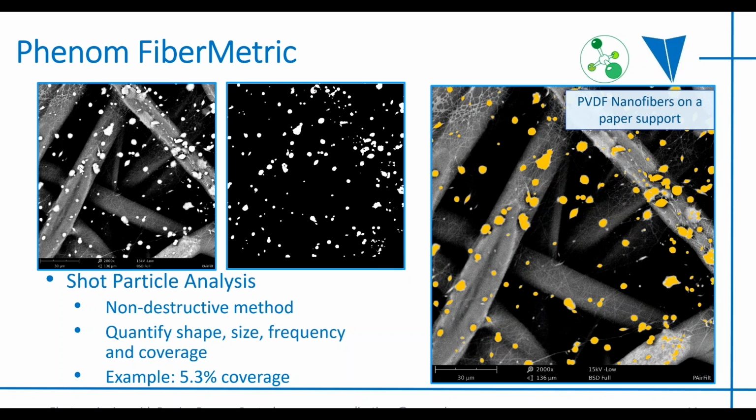So the viscosity was probably wrong, such that a droplet would form at the end of the needle and shoot this particle out occasionally. There is a web there that you can barely see in some areas. But what I did basically was I turned the voltage up on the SEM pretty high to 15 kilovolts. And at that level, fibers under 100 or 200 nanometers actually become mainly transparent. And so all you see are these shot particles suspended over top of the underlying substrate.